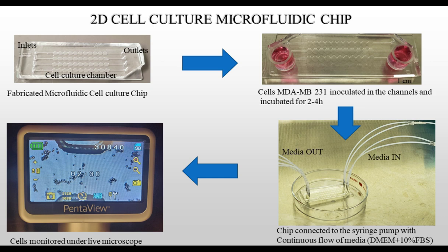We need to take care not to set the flow rate too high, because that would lead to the formation of bubbles, which is a major challenge in microfluidic 2D and 3D cell culture systems. Further, we incubate the system at 37 degrees Celsius with 5% CO2.